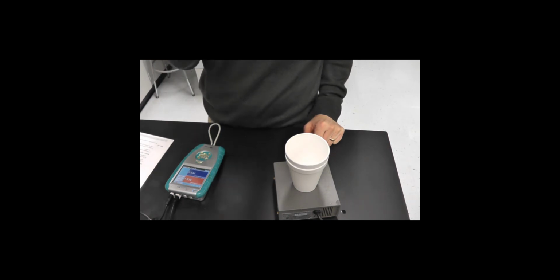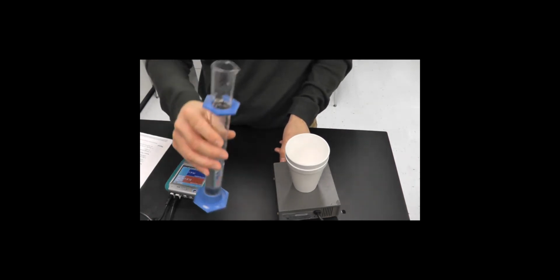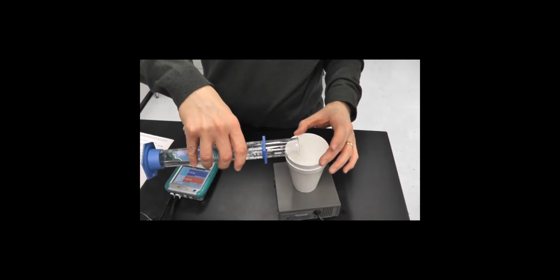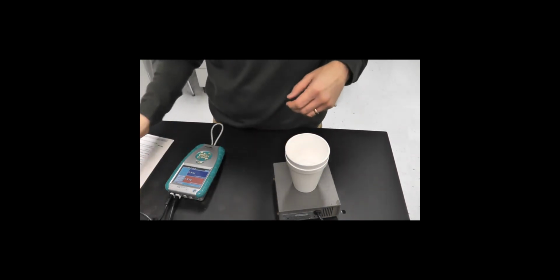So, similar to last time, this really is a fairly lame lab, so you're not missing a whole lot that you're not here. So I'm going to put the, I guess I won't slosh it around when I'm pouring hydrochloric acid. So there's hydrochloric acid, and essentially, same thing I did with the two waters. I'm going to pour this in, I'm going to have my temperature probe in here.